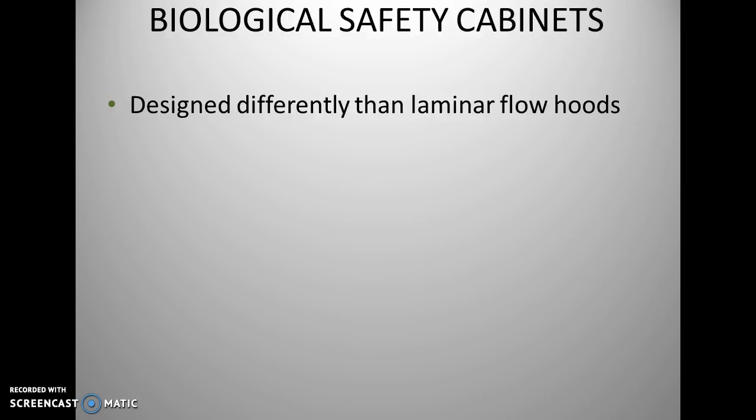Okay, all right. So we're done with fume hoods, and another type of area where we can work in a sterile environment is called the biological safety cabinet.